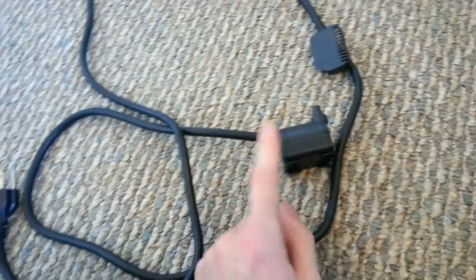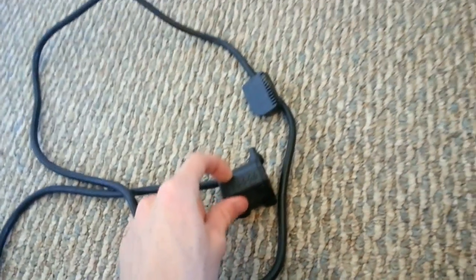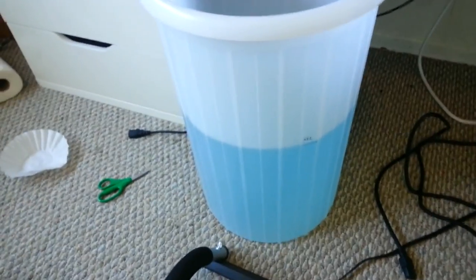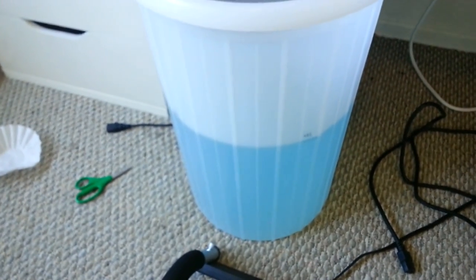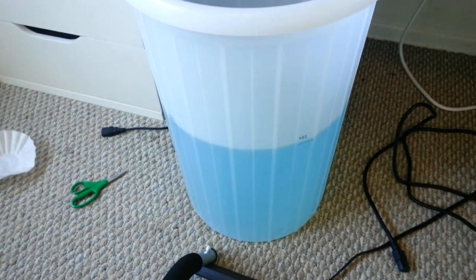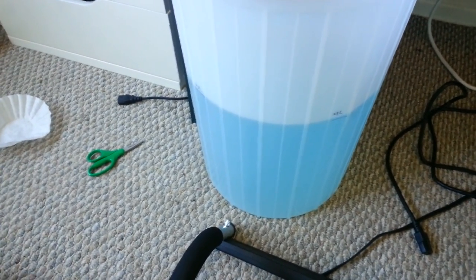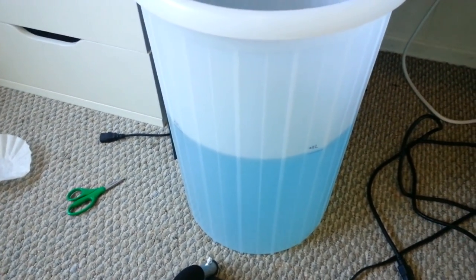It's a submersible pump, so you can plug it into the wall and completely submerge it in water and you're set. As far as water goes, this is a 23-liter winemaking container — it's the reservoir I use for having water that the condenser uses. It can actually heat up pretty well; you'd be surprised if you're condensing something for a long time. So you should use a lot of water.